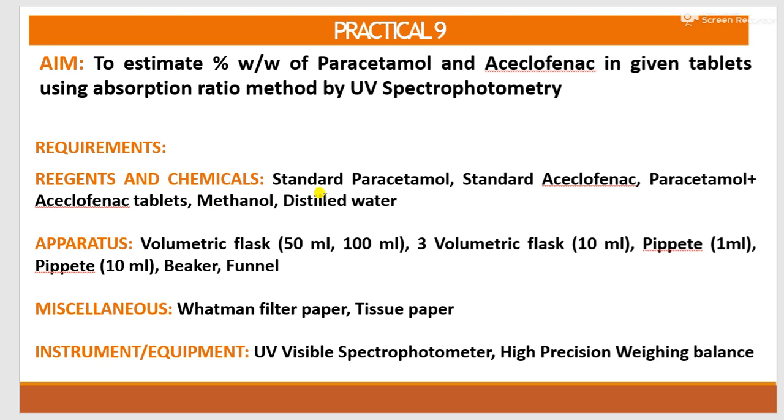You require standard paracetamol, standard aceclofenac, paracetamol-aceclofenac tablet, methanol, and distilled water for rinsing of the cuvette. Now, apparatus: you require volumetric flask, pipettes, beaker, and funnel. Miscellaneous requirements: Whatman filter paper, tissue paper. You require a UV visible spectrophotometer and a high precision weighing balance for weighing purposes.